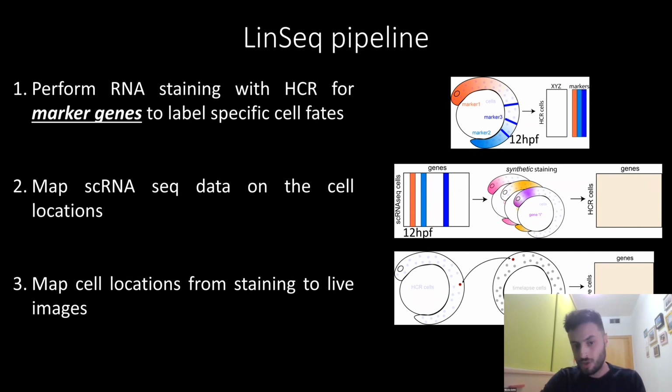So to explore the possibility of designing such a pipeline, we focused first on the development of zebrafish embryos, which you can see in these cartoons. This is mainly motivated in two ways. First, because it's a widely used model organism. And second, because single-cell RNA sequencing datasets are already available and can be explored nicely. Of course, this pipeline in general is not specific to zebrafish embryos. So in the future, we would like to try this in other organisms as well.